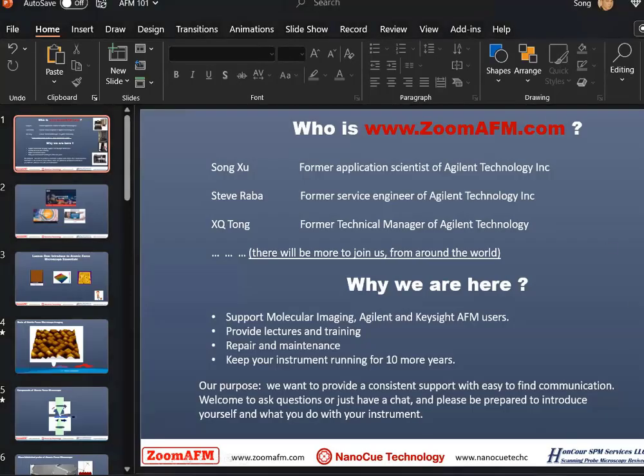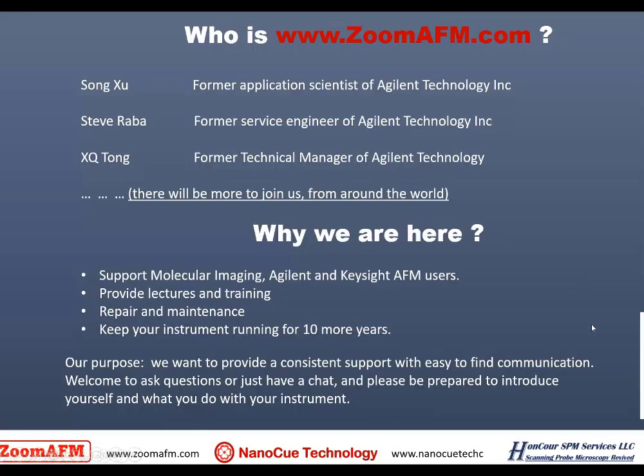Okay, so good. This is a recording version of this first presentation of the ZoomAFM. Before we start, I will introduce a little bit who we are and why we're here. ZoomAFM.com is a platform for us to organize and support users of the Agilent Technology Atomic Force Microscope.